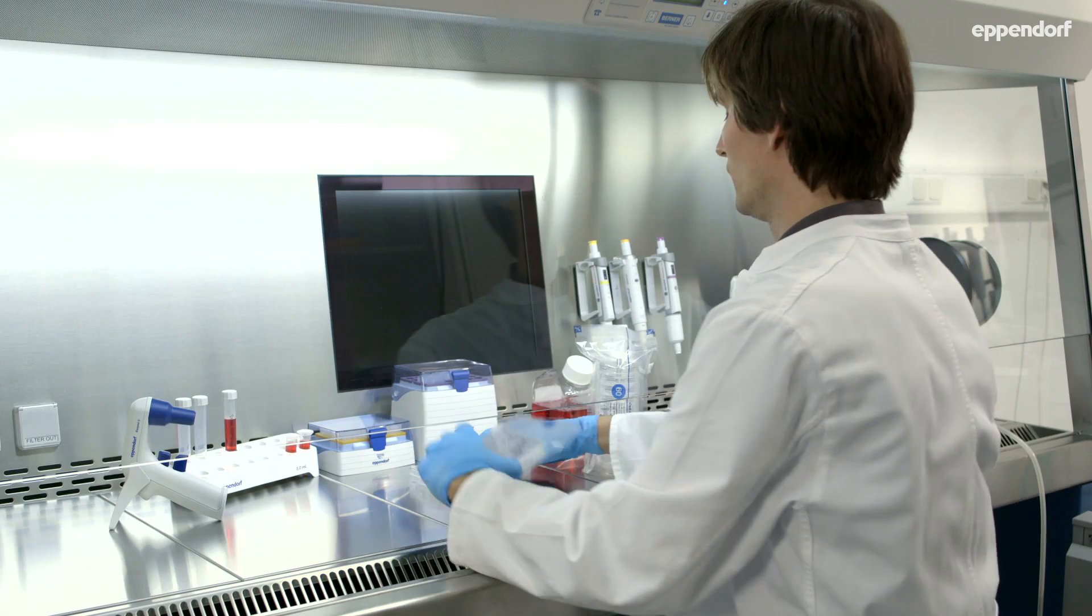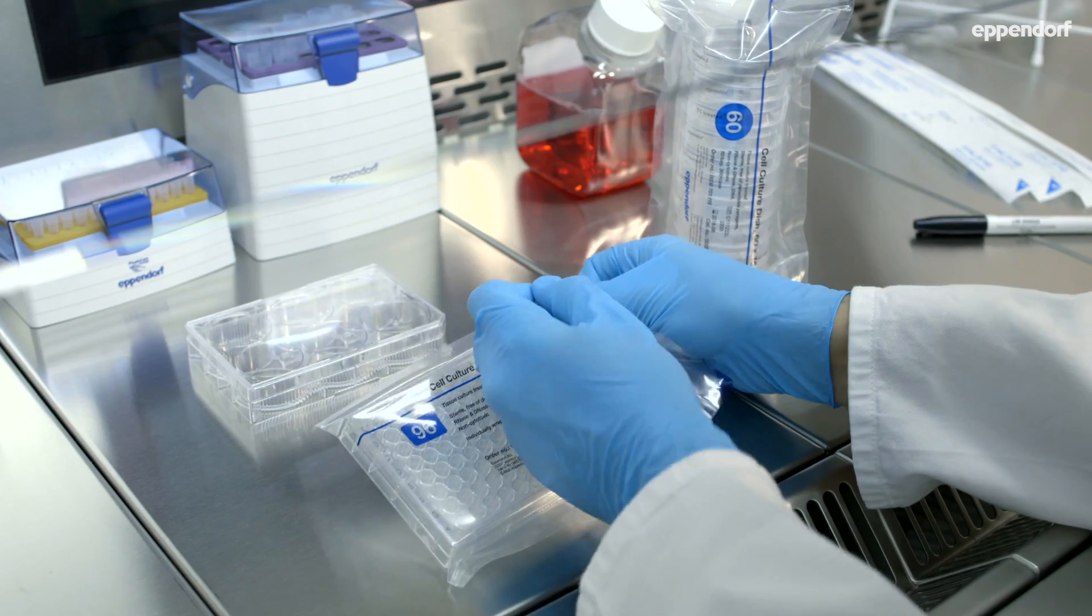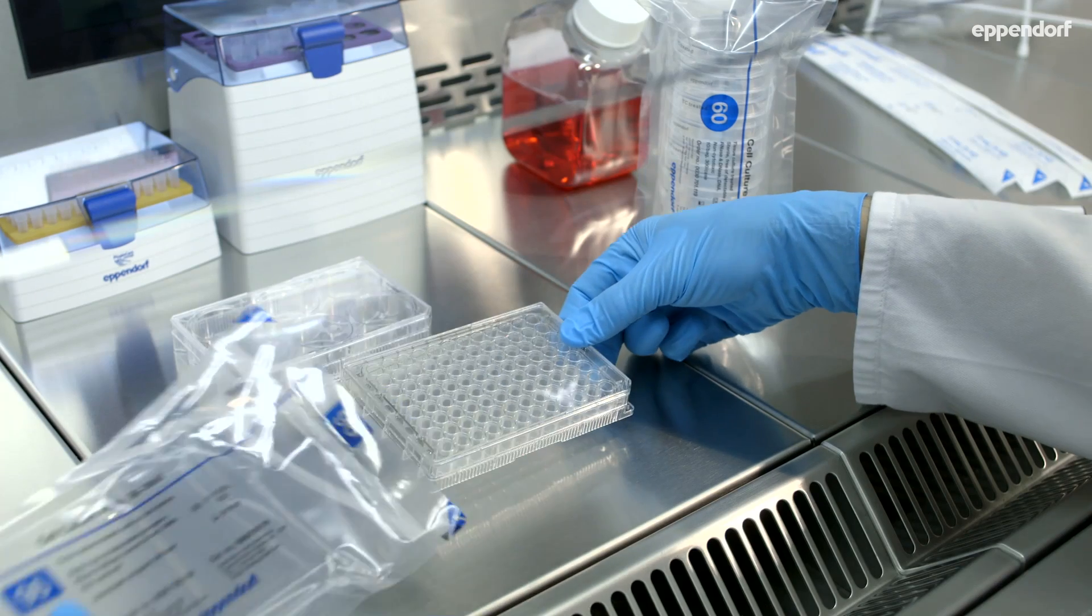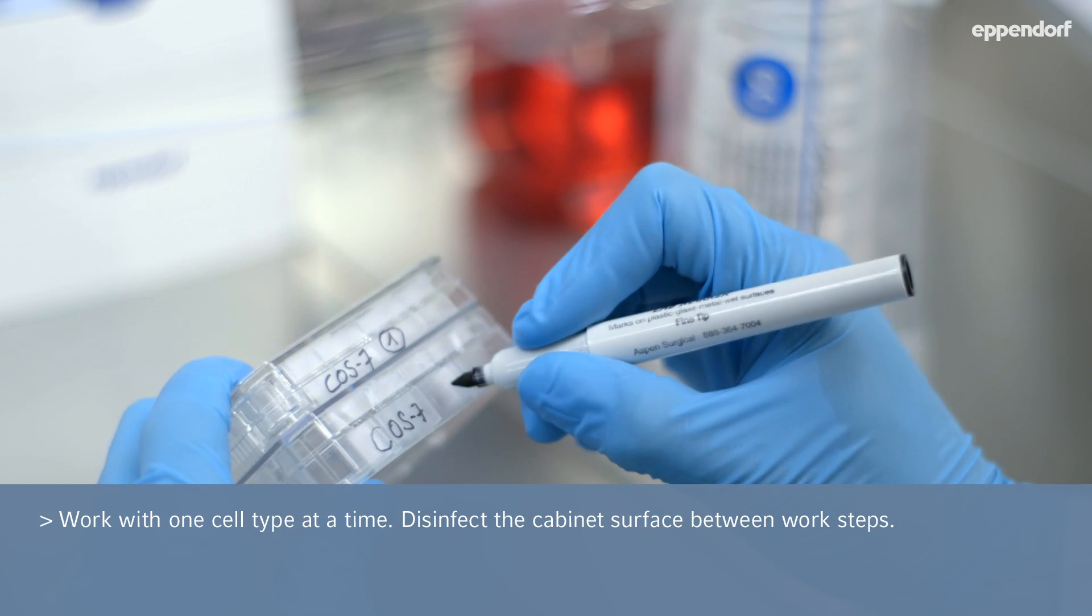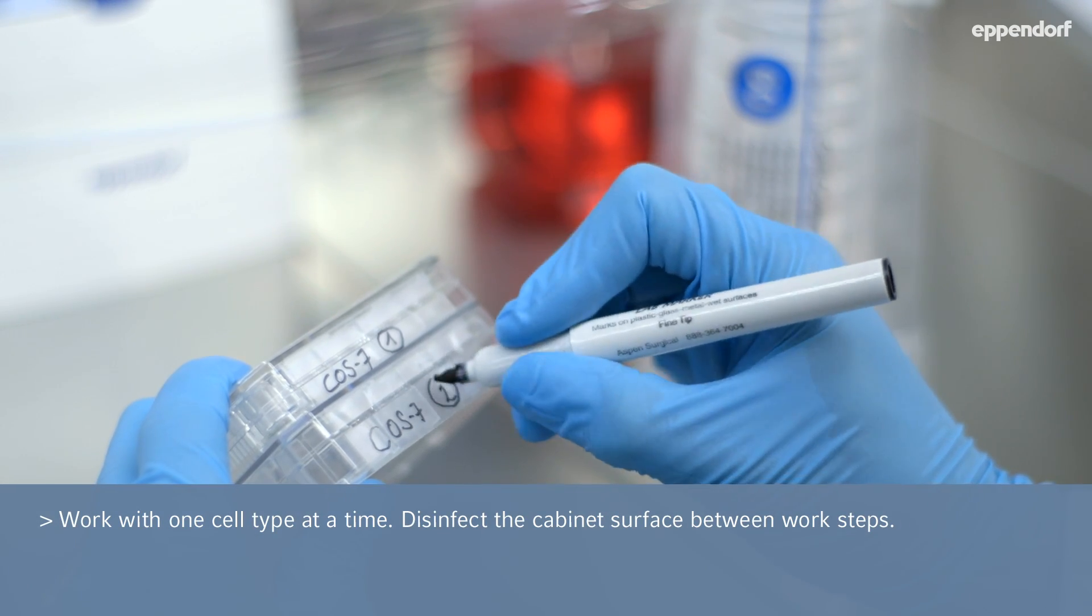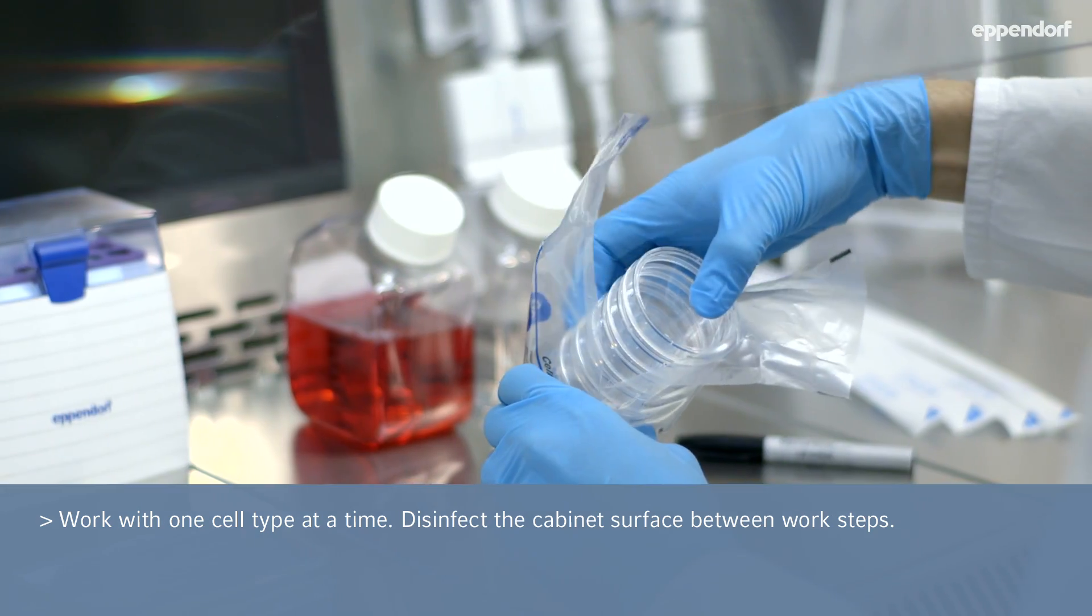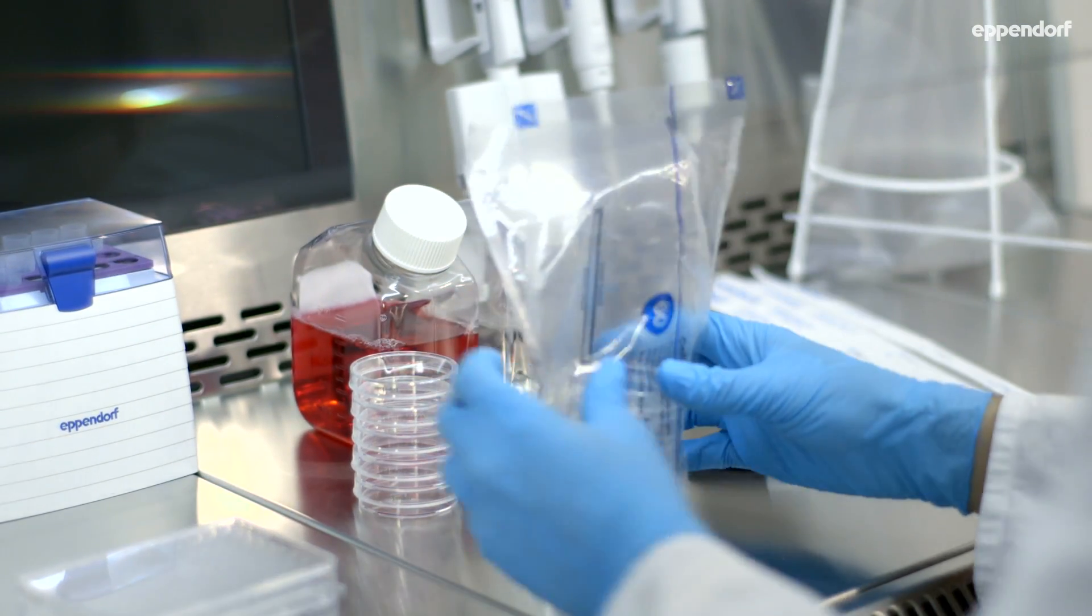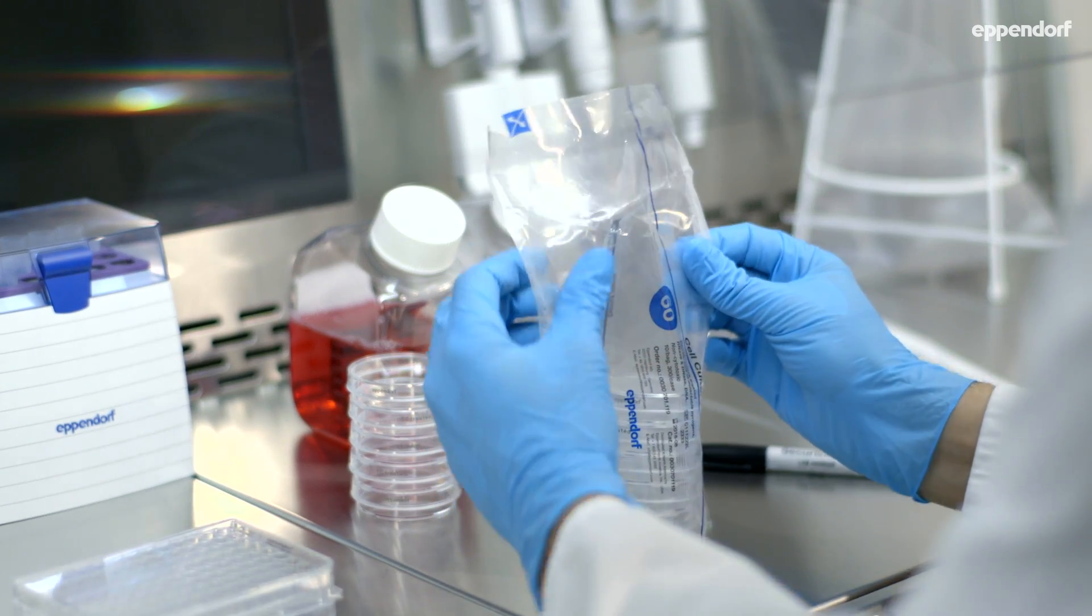Only open sterile packages inside the cabinet. Work with one cell type at a time and disinfect the work surface in between. Seal packages with remaining products properly before removing them from the cabinet.